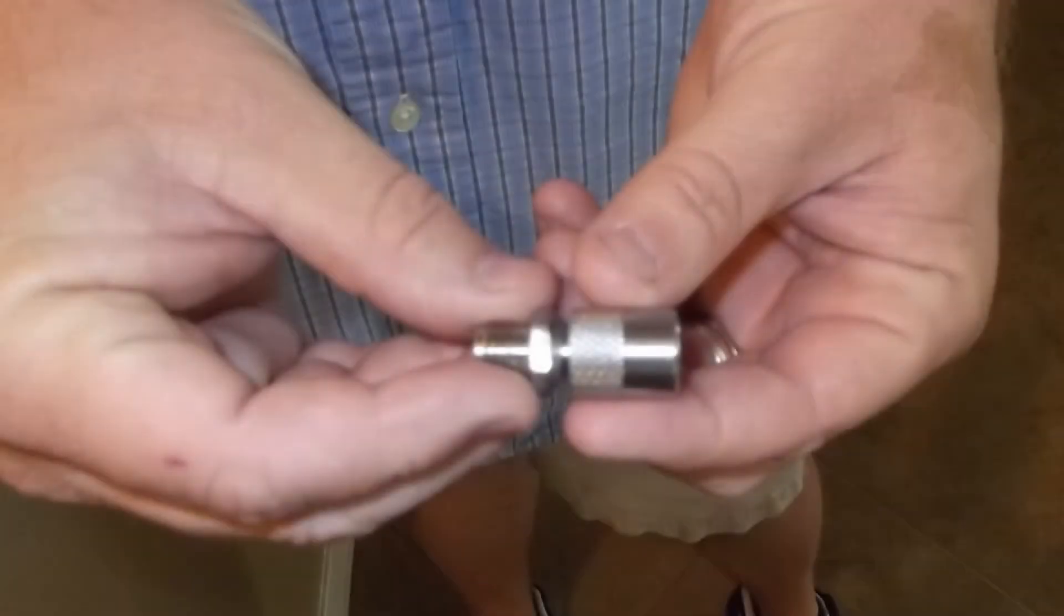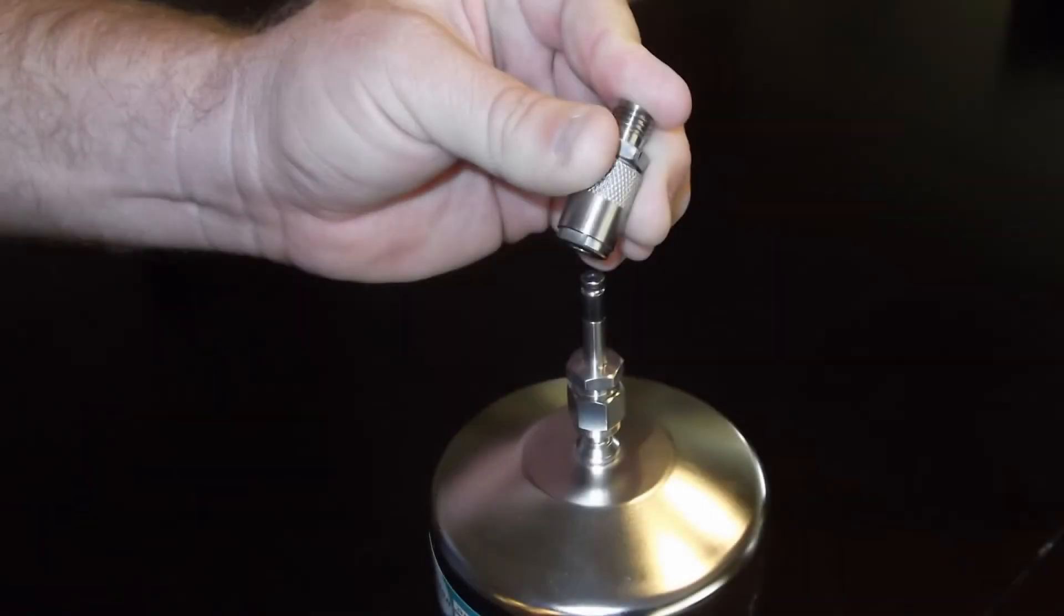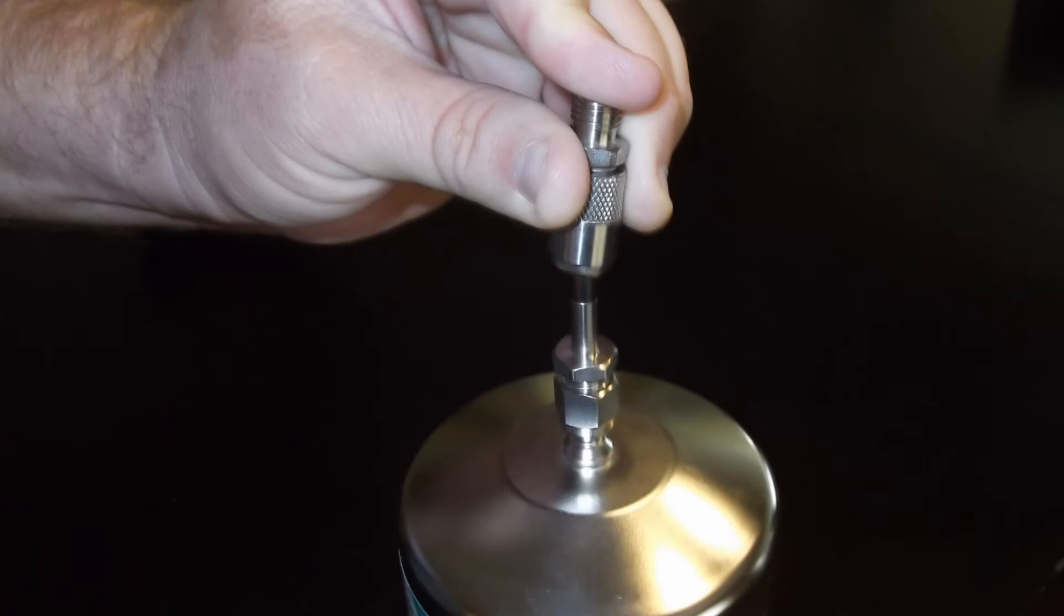Take the grab sample adapter and push the outer metal sleeve towards the nut. While holding the metal sleeve against the nut, place the grab sample adapter onto the minican and release the sleeve.